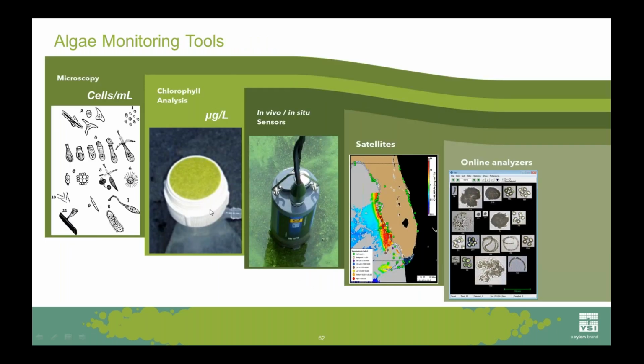So part of the reason that these units are still employed, though, the reason your sonde can tell you parts per billion of pigment, is because we're all just so connected still to these older technologies where we were getting cells per mil and parts per billion of pigment. That's why people are comfortable with these units. They've been around forever, and we like to think in these terms because sometimes we're trying to compare sensor data to older data. But the sensors really don't directly measure these things.